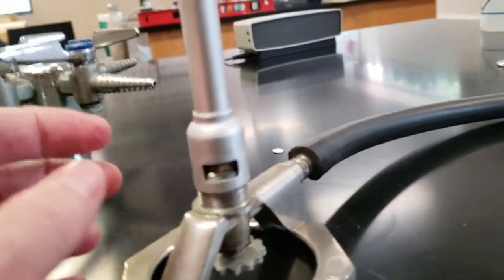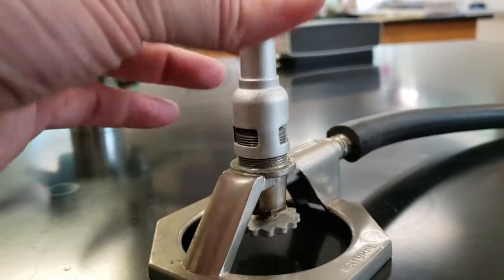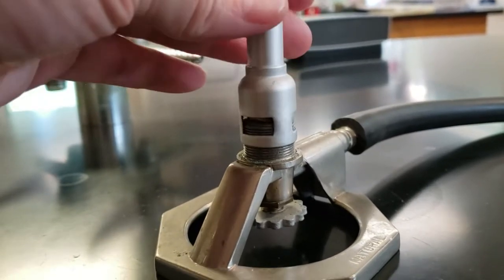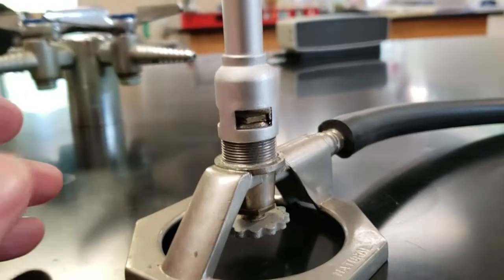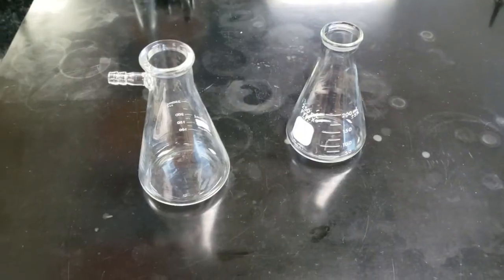But we need to close these things off to start them and open them once they get lit. So here we have to close the opening to not let air in, and now we're opening it to let air in. But you have to screw it around multiple times, multiple 360s, for it to actually open up, unlike the Bunsen burner.